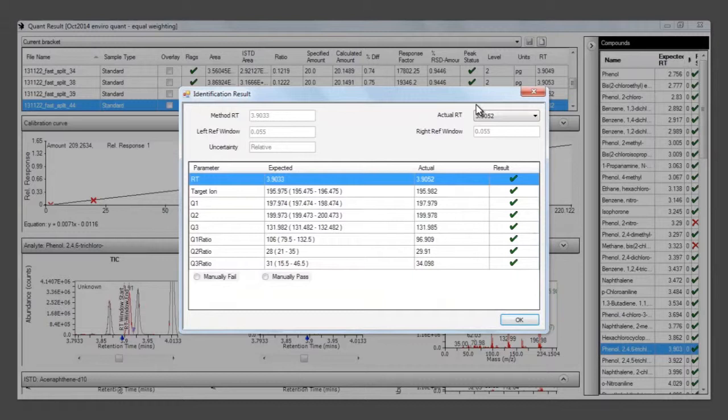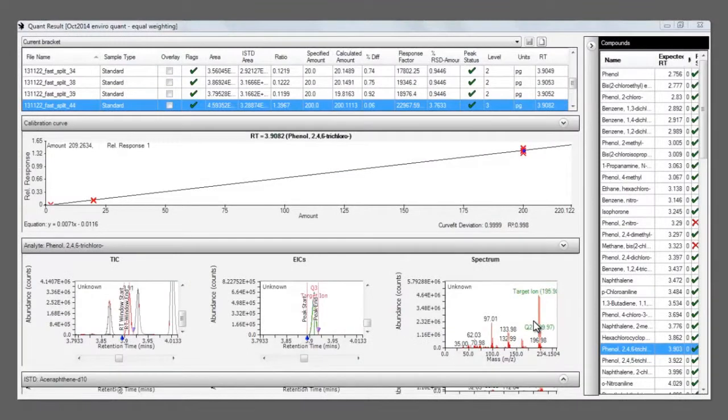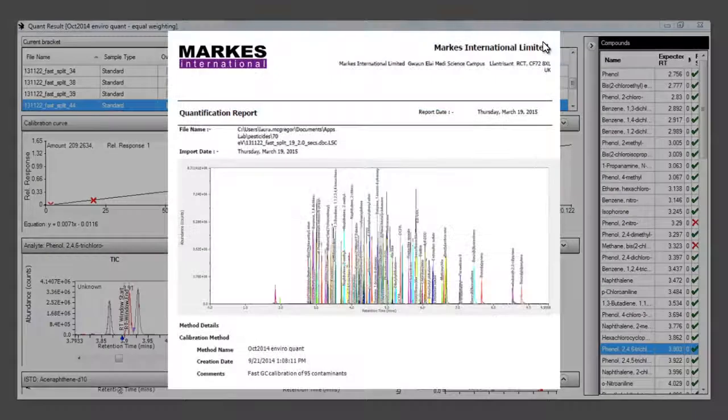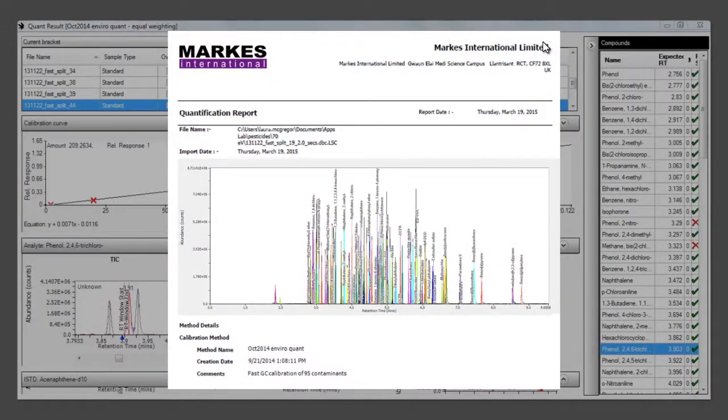If a ratio is slightly outside the specified limit, you can override the initial software decision. Finally, any changes can be saved, and a calibration report can be created using the icons at the top.